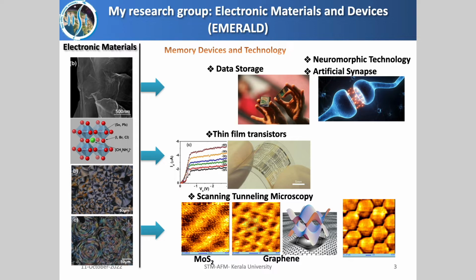Normally STM scares people, because STM is not a very simple thing. If you are doing STM, you have to know what you are going to look at. Without knowing, if you are looking at images of STM, you may not understand them, or you will interpret wrongly. So those things can happen.